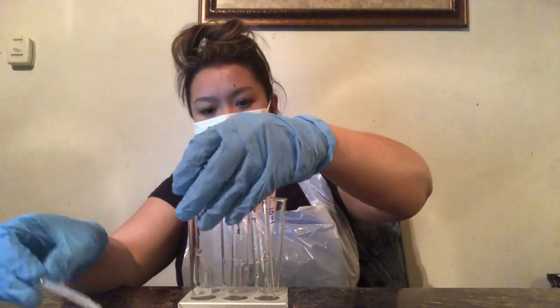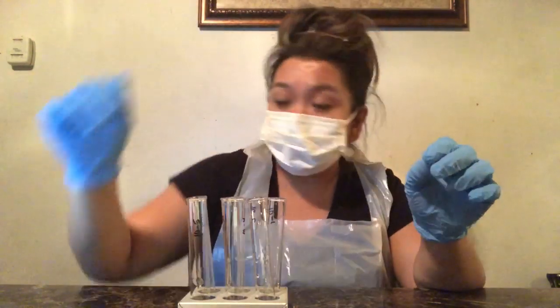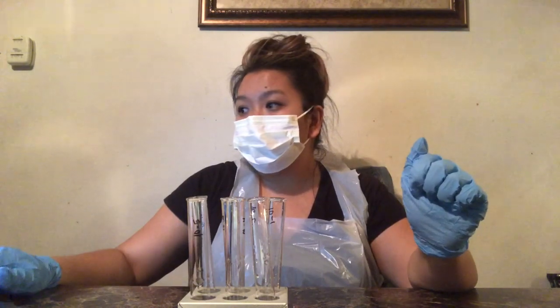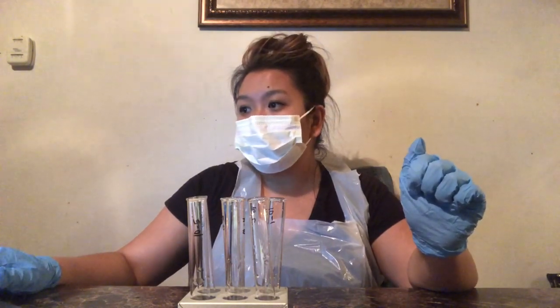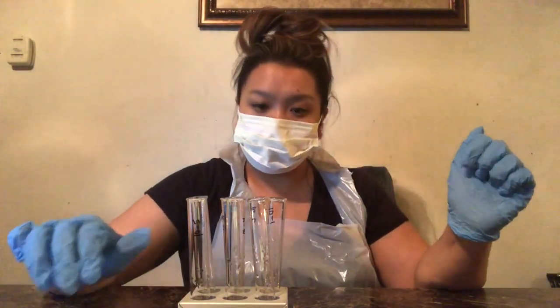Okay, so they have all been passed around. What I will do then is rinse my pipette off in the distilled water to make sure all the organisms are gone. And now we'll start inoculating the plates.